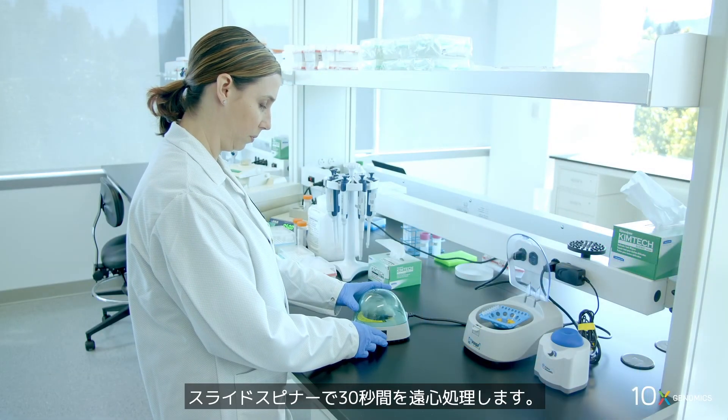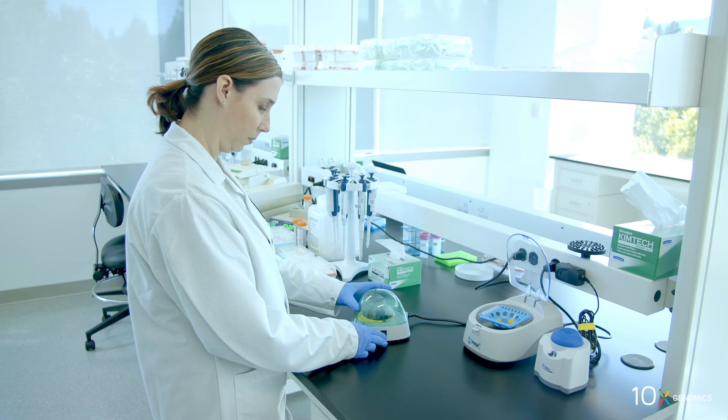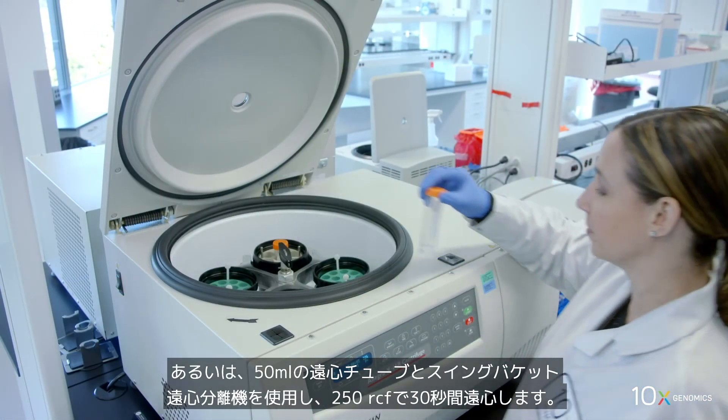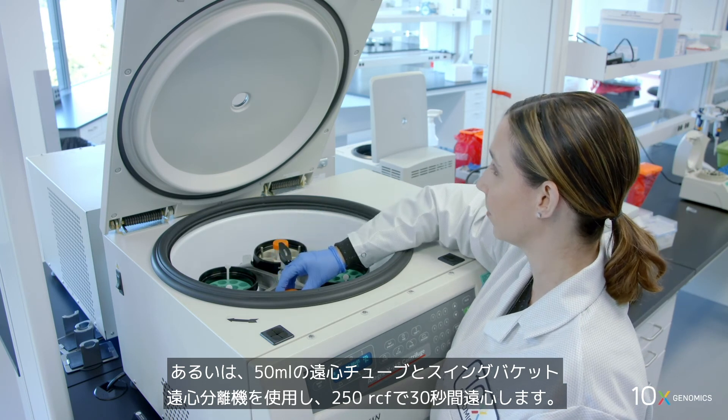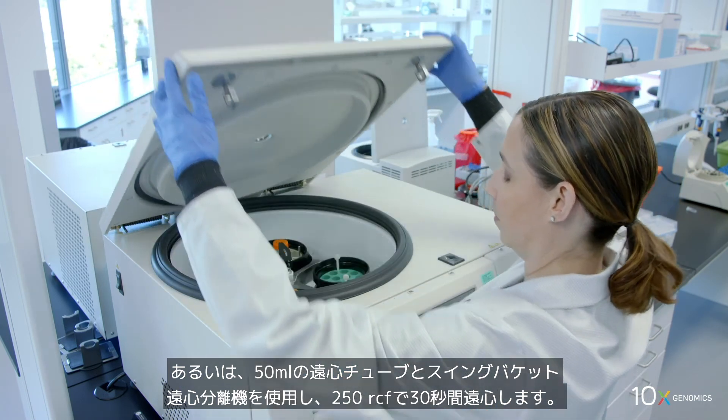Centrifuge for 30 seconds in a slide spinner. Alternatively, use a 50 ml centrifuge tube in a swinging bucket centrifuge and spin at 250 RCF for 30 seconds.